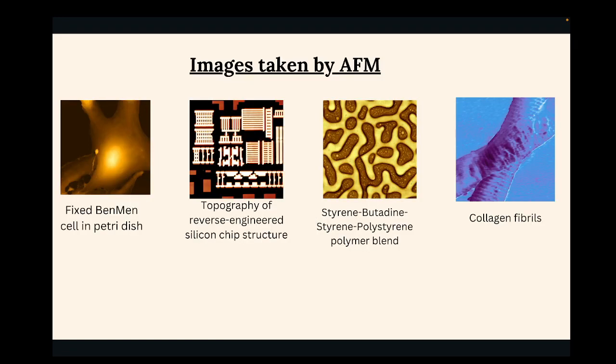What I told you earlier, that I will be showing you images of how it is used in semiconductor devices. See the topography of reverse engineering a silicon chip structure. This is done with the help of AFM alone. So this is how the structure is there in the chip. It is generally done with the help of contact mode.